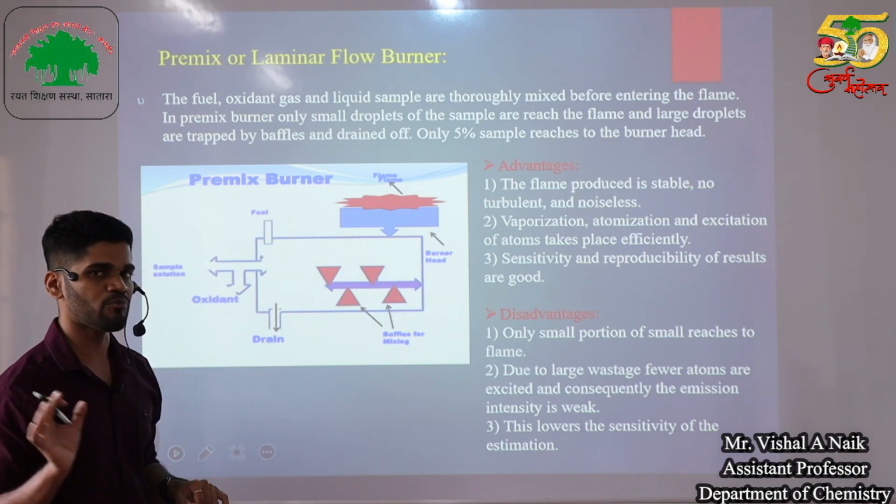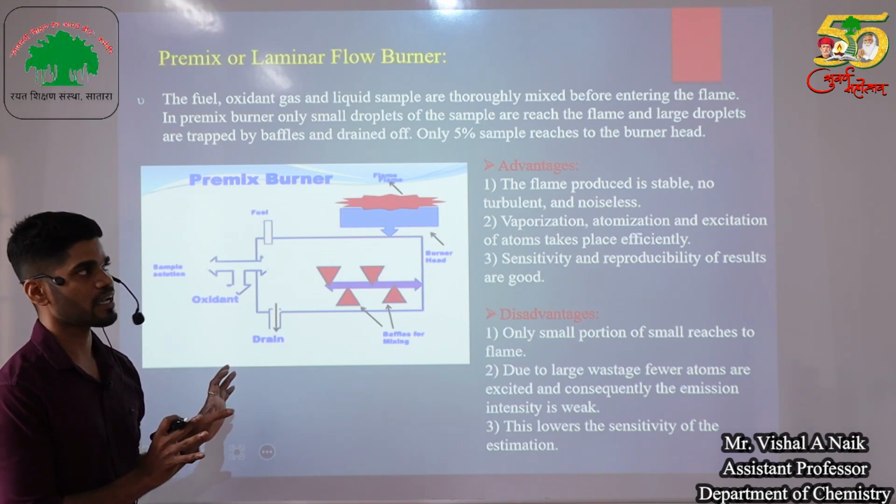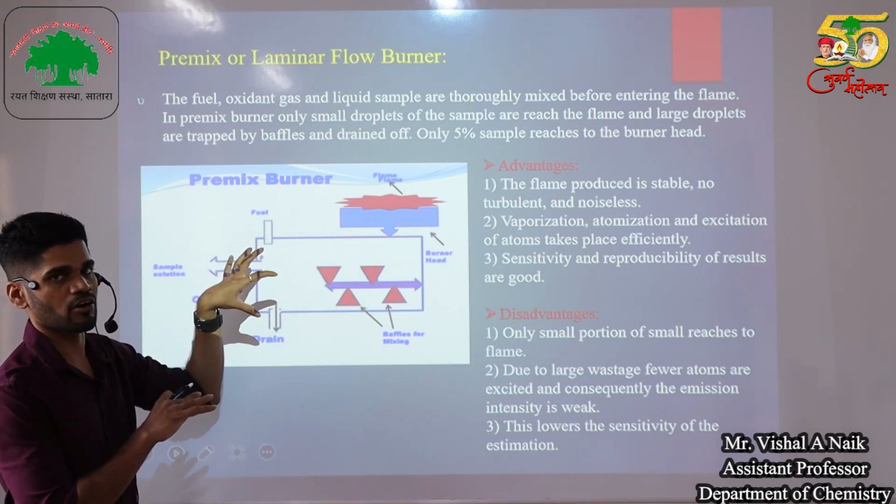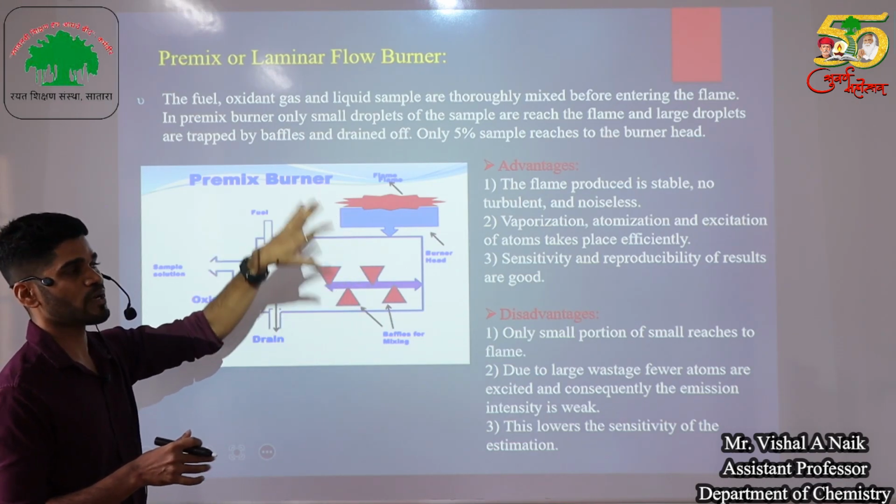So only 5% of the sample is introduced into the flame. Okay, so that's why it is called a premix burner, because the sample is mixed before it reaches the flame.